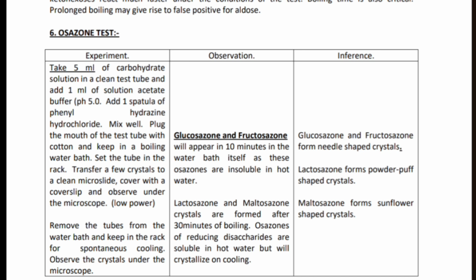Boiling time is also critical. Prolonged boiling may give a false positive for aldose, so you can't just keep boiling it, because if glucose becomes positive, you will assume this is fructose, which is not needed. So don't prolong the boiling.